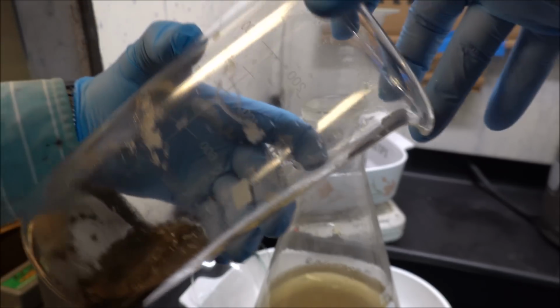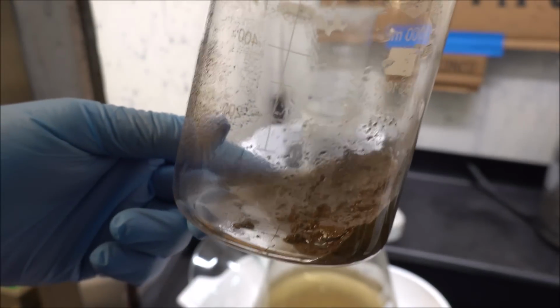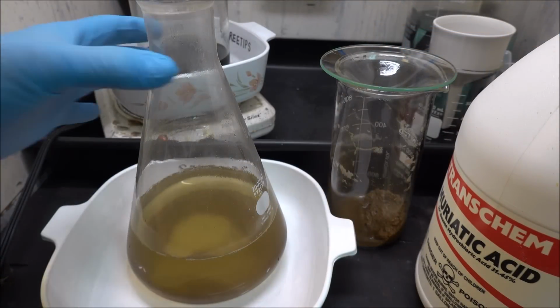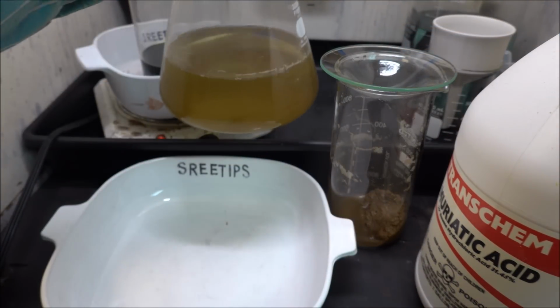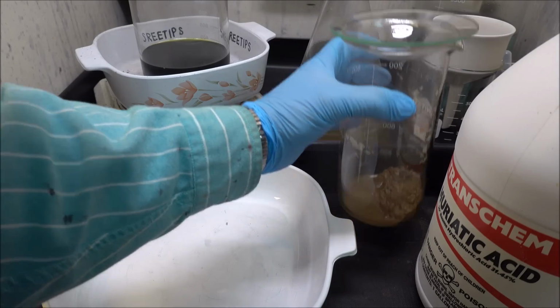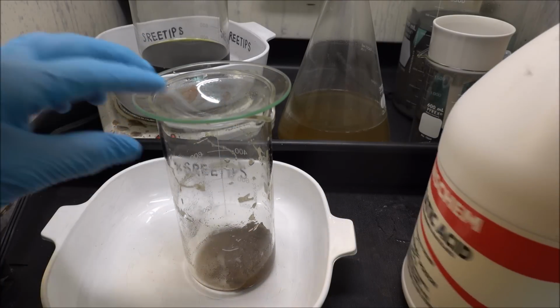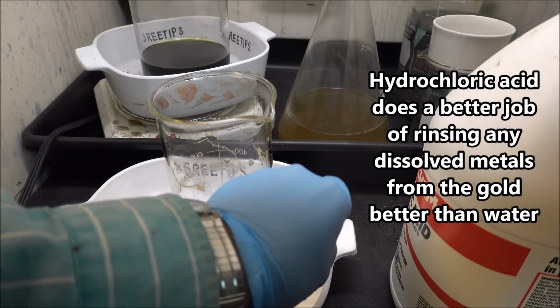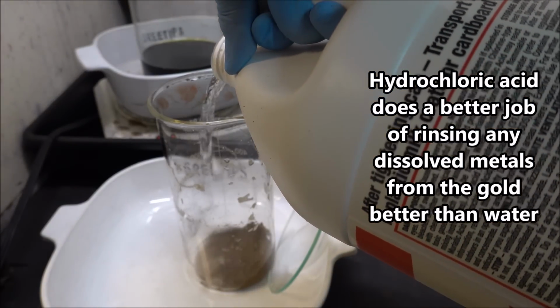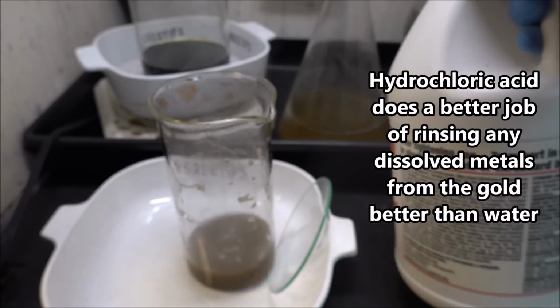Here is our pure gold powder. Okay, I've got some hydrochloric acid here. I'll set the waste container in the back. We're going to rinse this gold with some hydrochloric acid now, get those excess chemicals off of there that may be present.